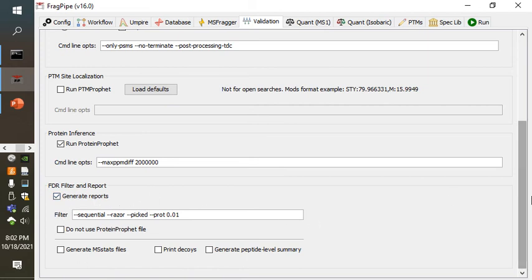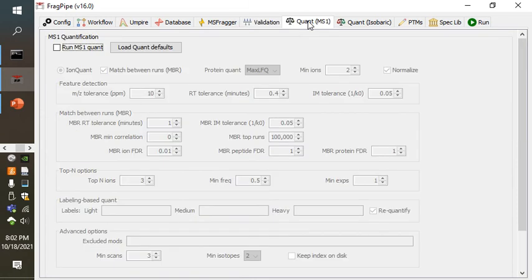Now, I want to note that something that we haven't clicked on here is an option that says export FASTA subset. You might think that this is an option we have to select, but helpfully, that happens completely automatically, and we don't have to specify that it does happen. So that's a gimme.